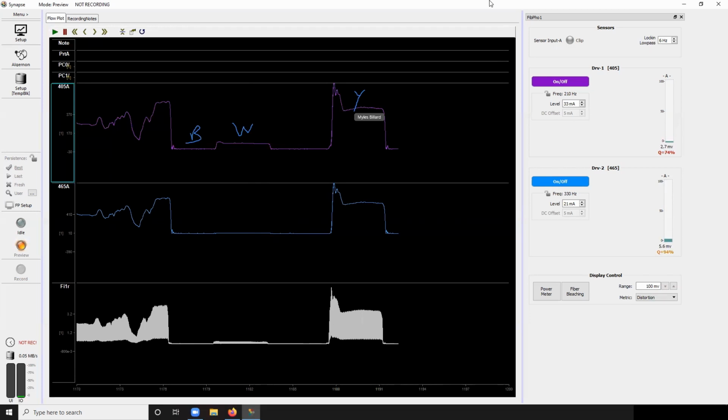Now, if you have fluorescent slides, you can do the same thing. That's actually kind of what the PM1 is doing. But basically what this is showing you is, with the same two colors shining on the same fiber, I can distinguish different signals. Now it's just a dumb little test where, okay, why does the 405 increase over the white? It works that way, and that's fine, it is what it is. But it's showing you that there are differences here. Again, there was a very tiny little bump here, but it's just a silly little benchtop test. Doesn't matter. In any case, lock-in amplification, it's looking good, it's working. We're happy with how this is functioning.